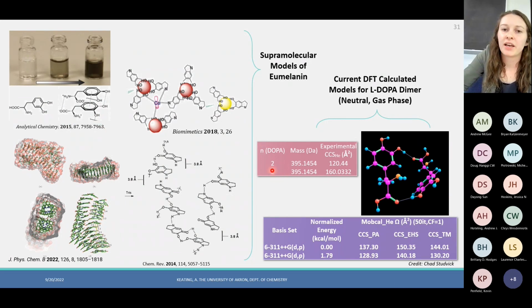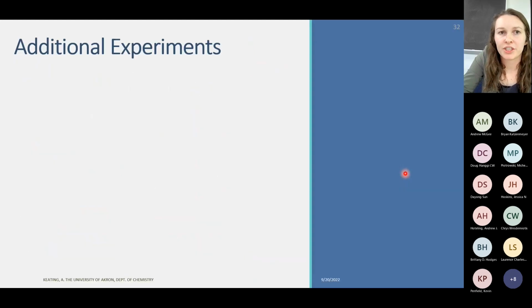Our data for that exact species as the protonated structure actually showed a CCS about 40 angstrom squared. So for me, that suggests that they're unfavorably linearly hydrogen bound and then collapsing on themselves into these more stable states as they are provided enough energy.